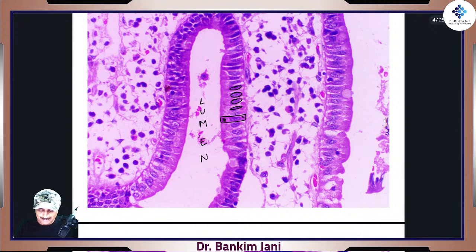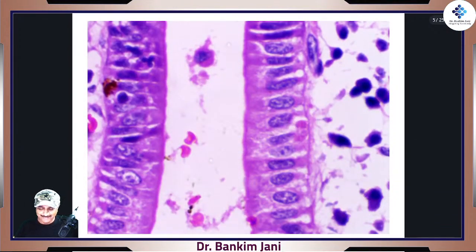See, basically we are lalchi. And when we see this, at least I felt like, must. See, this one. Such good nuclei, right? So smartly and so beautifully they are arranged. And see how nicely the entire cell is seen, right? Oh, right?